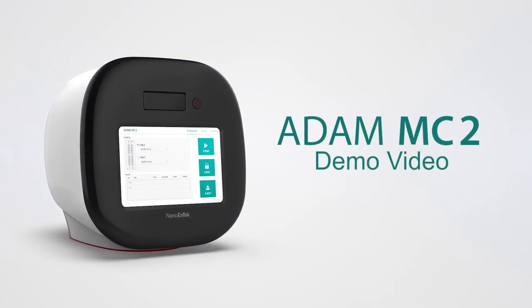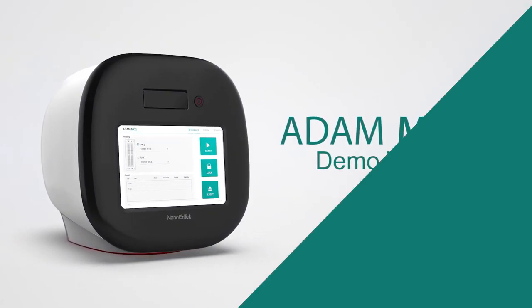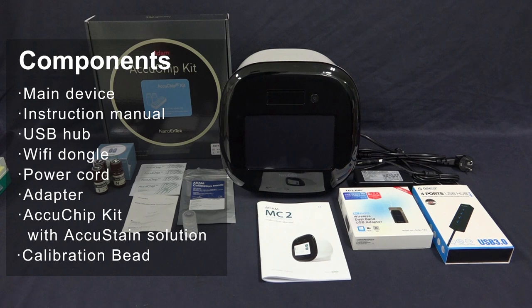This video is about how to use Adam MC2 cell counter. The components of the Adam MC2 are the main device, AccuChip kit, and accessories for the Adam MC2 use.